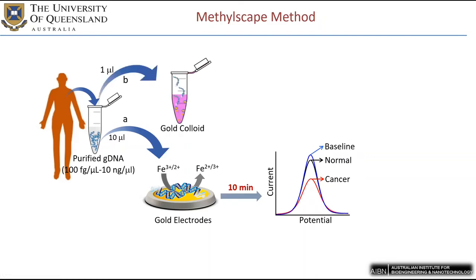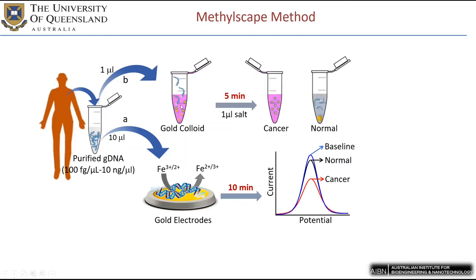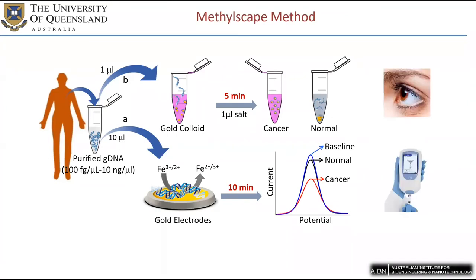We developed another naked eye detection technique based on gold nanoparticles, where we added the DNA into the gold nanoparticle solution and then incubated it for 5 minutes. Because cancer DNA has more affinity towards the gold nanoparticle surface, it provides extra stability to the nanoparticles, and that's why when we added 1 microliter of salt into this solution, it retains the pink color of the solution. However, in the case of normal DNA, because there is less adsorption of the DNA onto the gold nanoparticles, there is no extra stability for the nanoparticles, and when we add salt, it turns the color to blue or colorless, and we can detect it easily by naked eye. So this is the simple method we developed.